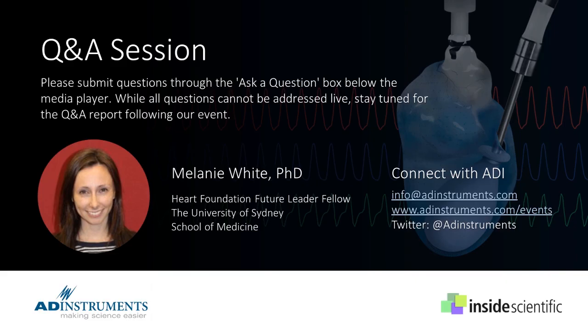Okay, fantastic. Here's another question. What is the importance of blood gases, lactate, isotonicity, osmotic pressures, and so on? And how do these affect heart function? Without a shadow of a doubt, they definitely have the ability to influence the performance of the heart.